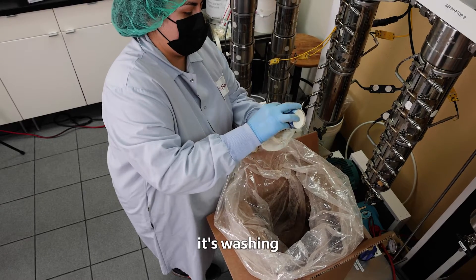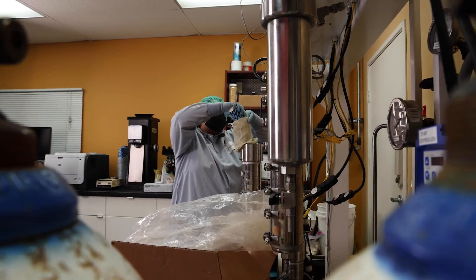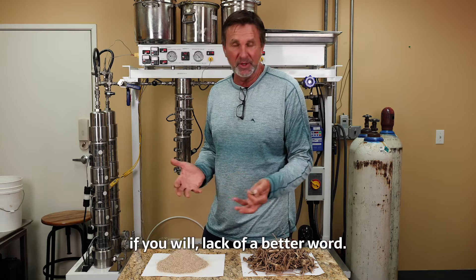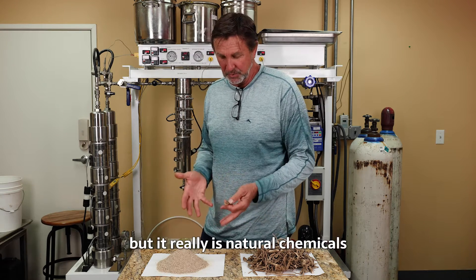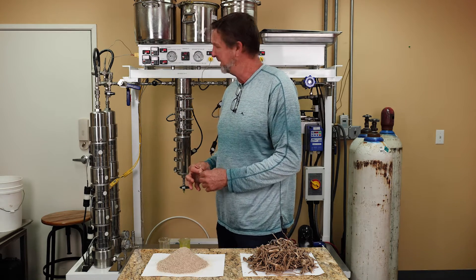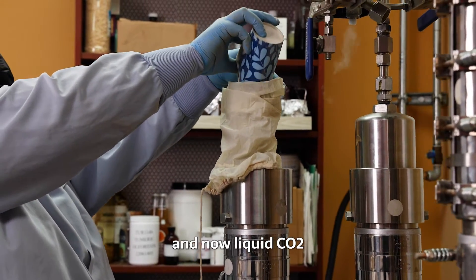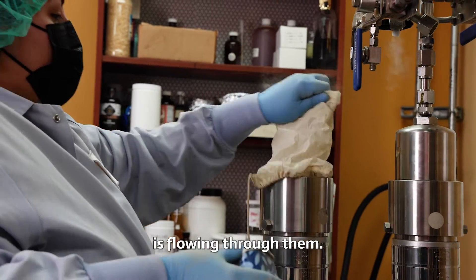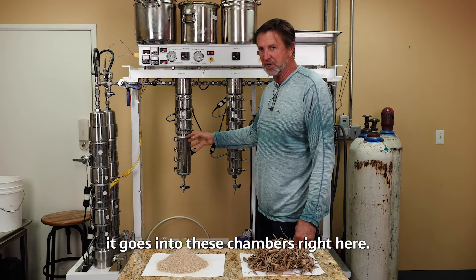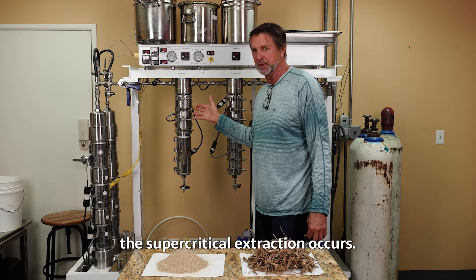When it acts as a solvent, it's washing this material. Liquid CO2 is washing and stripping away those plant chemicals — natural chemicals that are occurring in the root. And that all happens inside this tube right here. These tubes are filled with that powder, and now liquid CO2 is flowing through them — actually flowing from the bottom up. As it flows across, it goes into these chambers right here, and each one of these chambers is where the supercritical extraction occurs.